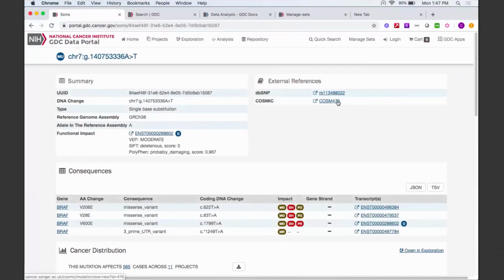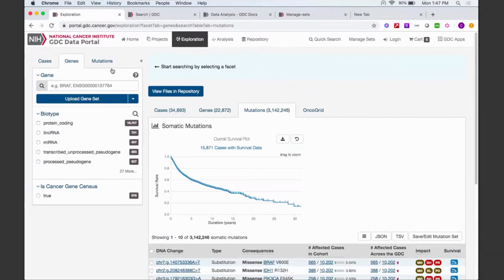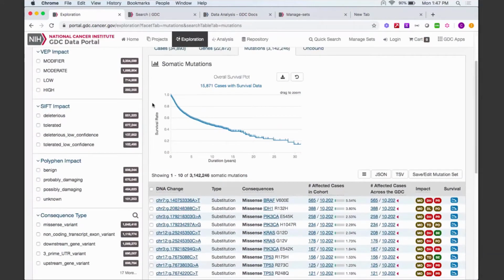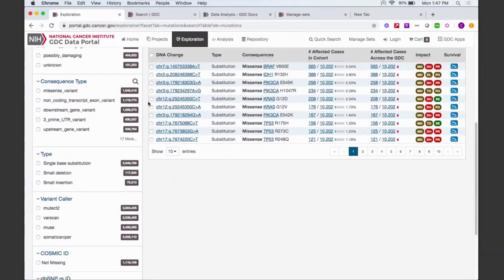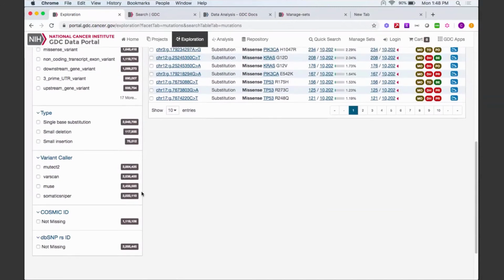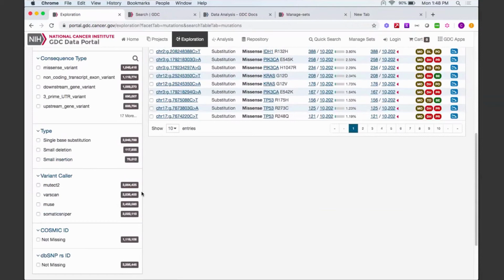And will you also go back to show what they can select for on the faceted search for mutations? Just looking at the left panel to see the different types of information. Okay, so the answer is CIViC is going to be added very soon. Actually, I don't think there are any immediate plans for ClinVar, though I might not have the most up-to-date information on that. I don't know, Sharon, if you have any more information. For the most part, we're focusing on CIViC in the next release, not ClinVar yet. Yeah, that was my understanding as well.